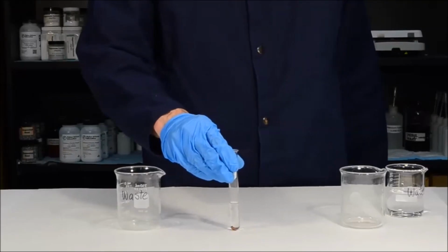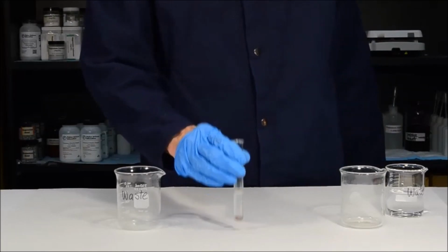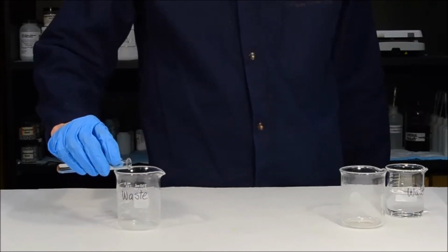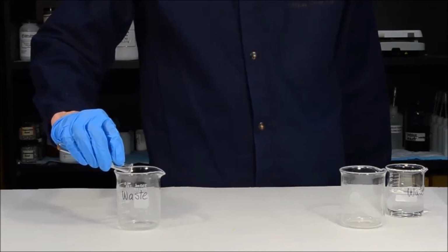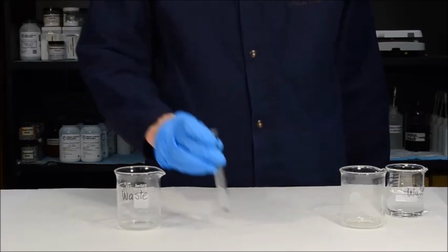Now I want to decant the solution. Decanting means pouring the liquid off of the top of the solid. To do that, you're going to need to use a waste beaker and simply pour the liquid off of the top. It's very important that you pour gently as to not remove any copper metal from the test tube.